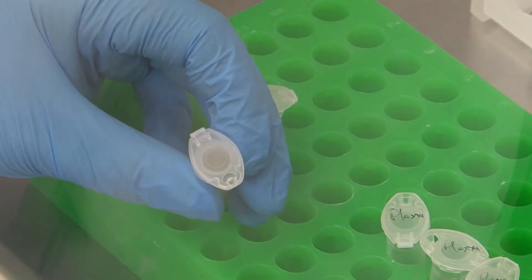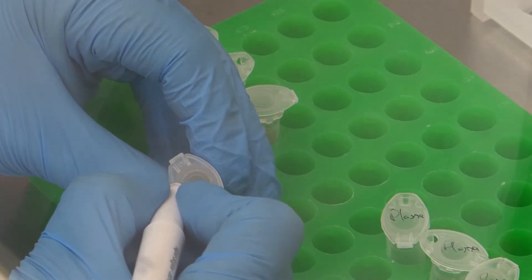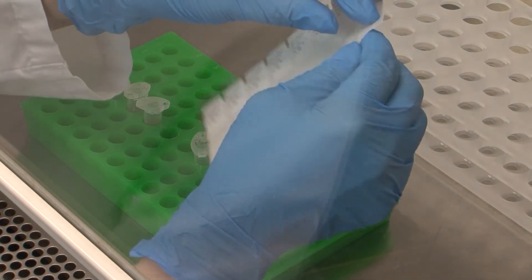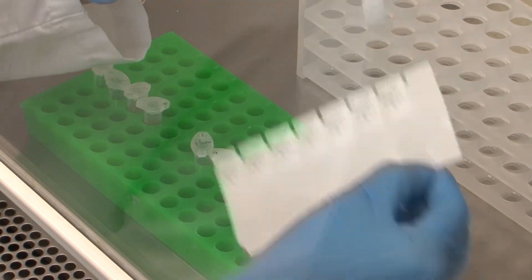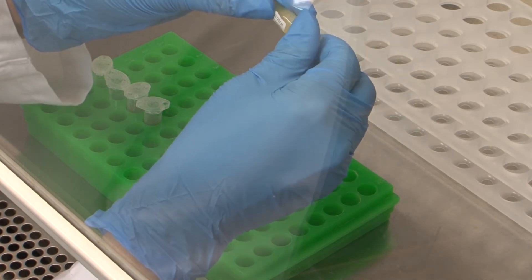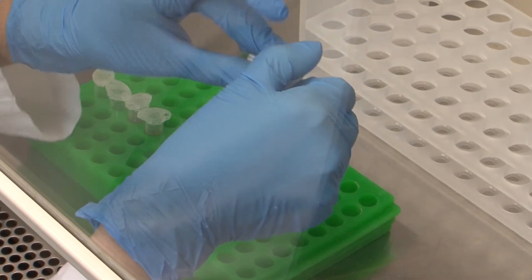Tubes containing plasma or serum should be labeled with the patient ID number, the date and time at which the sample was obtained, and the sample type. This information can either be written on the tubes with a permanent marker or provided on a label.